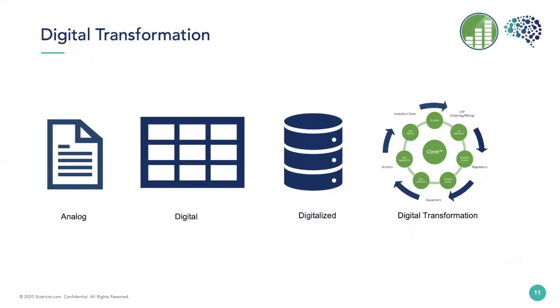Digitized or digital is when you move that paperwork into spreadsheets or maybe an old siloed system. And then a digitalized system, what we're talking about today, leverages all of that digitized data and digital technologies such as API integrations to related databases or connectors to technologies like IoT sensors in your vivarium, machine learning or AI algorithms that tell you if they think a cage is being flooded and warn you preventatively. All of this improves the processes, drives efficiencies, and it does more with the existing data and enables new data.